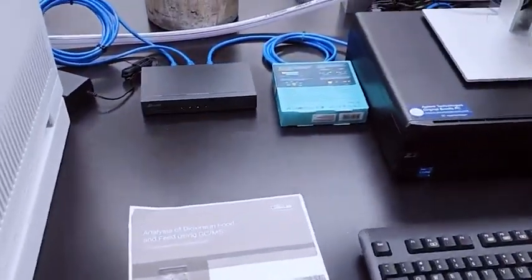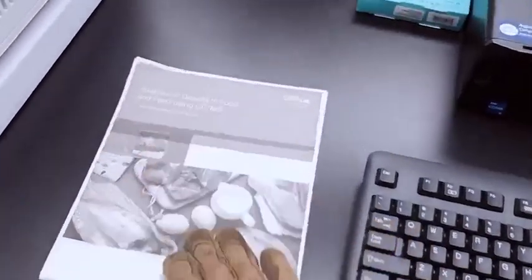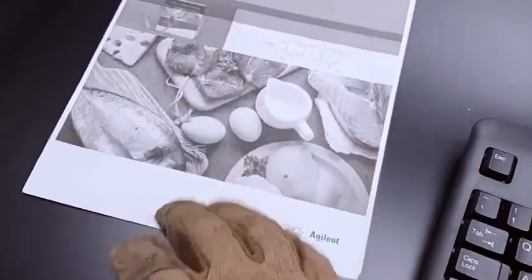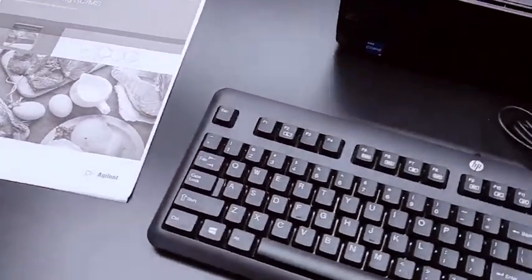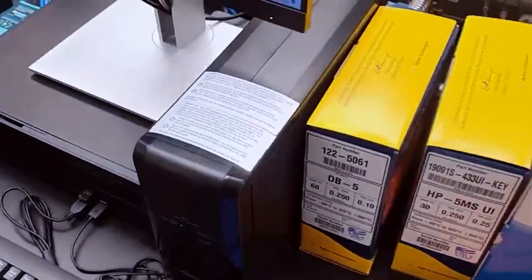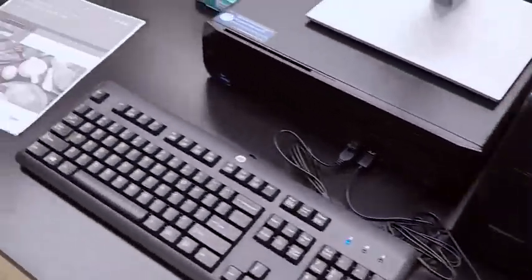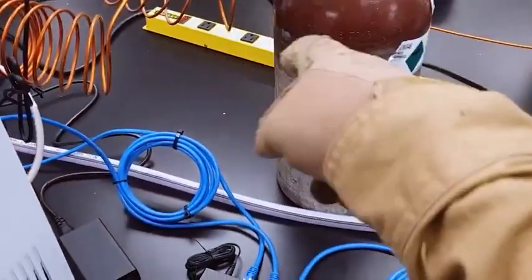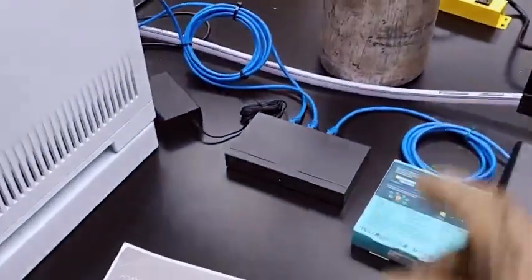Here's the analysis of dioxins in food using GC-MS — this describes one of the methods that we're using. Here's the computer system, brand new setup, and some column boxes. This thing runs on helium and we're going to need a lot more helium than this, but we're going to be burning through tons of helium on this.